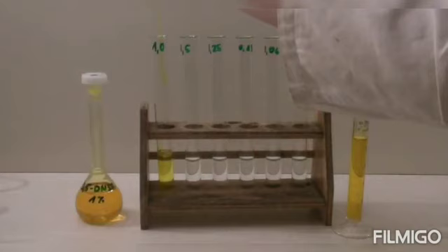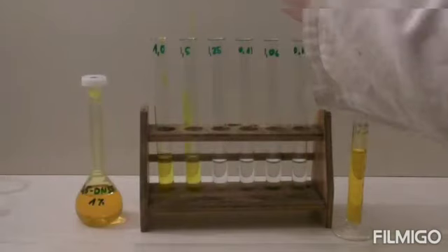Then here we have taken different concentrations of glucose, that is in first test tube 1 gram, in second test tube 0.5 gram, in third test tube 0.25 gram. This is the decrease in the concentration of glucose in every test tube.